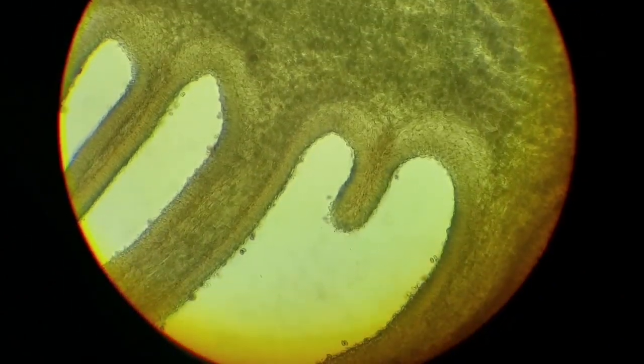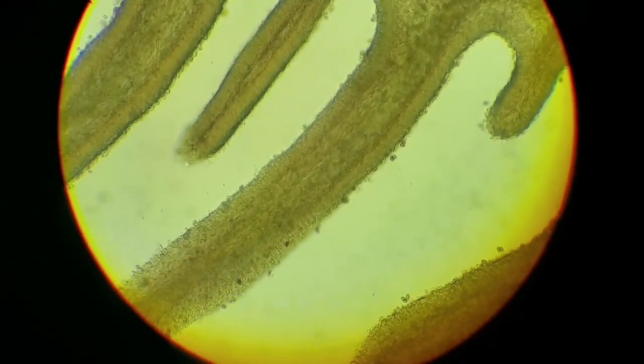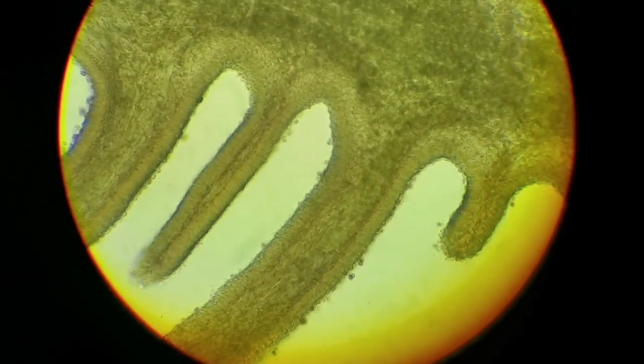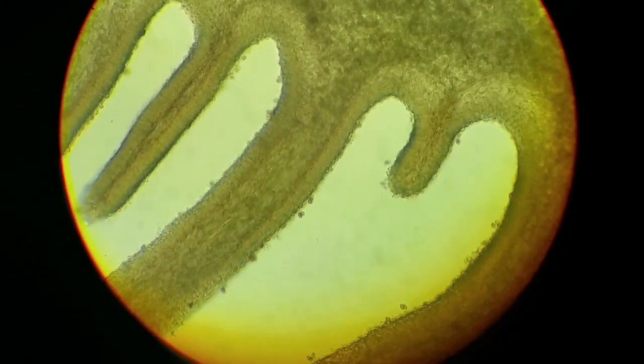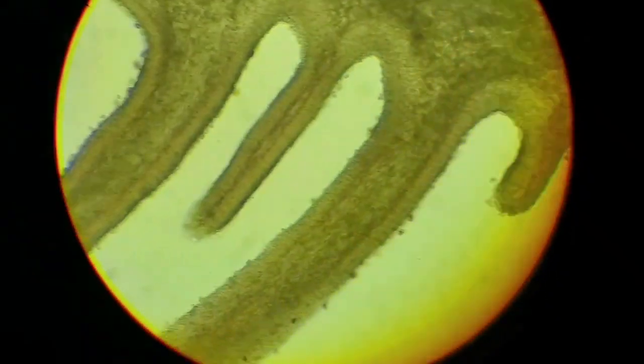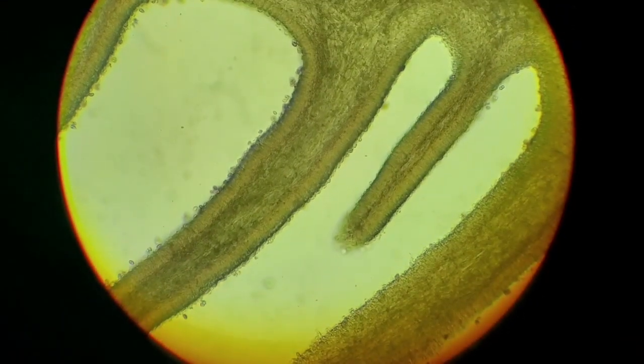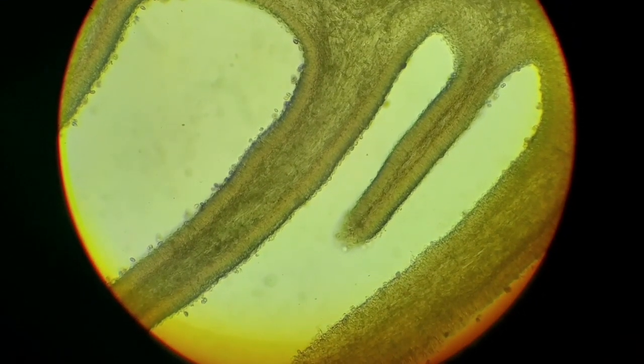This is a truncated gill. You can see the edges there. This also looks like a truncated gill, also because look at the width. It's much more narrow than these other much longer gills. But basically this is what you want to see. You want to see a hair comb. You want to see basidia to the sides, not facing you but to the sides.